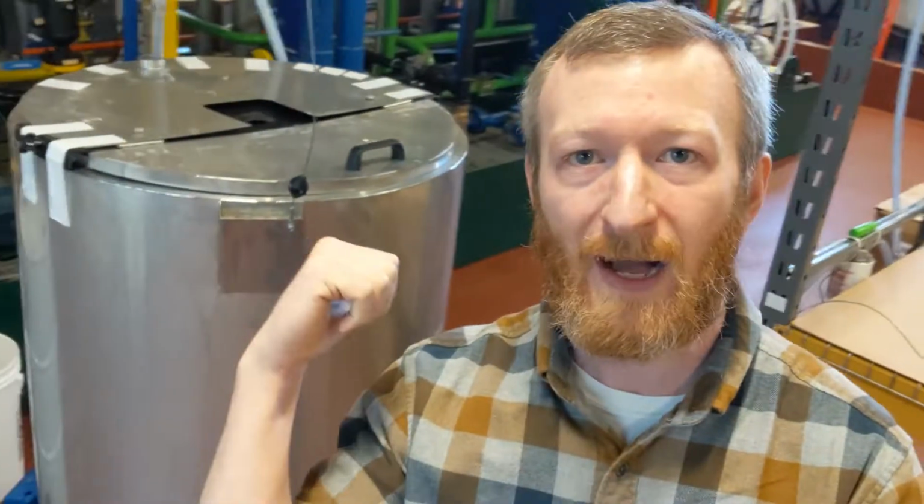The other cool stuff that we do here in the lab is focused on being the zero waste production facility. So we take that glycerin byproduct and we turn it into the soap that's used at the university. So this stainless steel vessel behind me is what we use to make soap. We take that glycerin byproduct, we remove any excess methanol that's left over in that glycerin, and then all of the other things that are making our glycerin fairly low quality compared to pure glycerin, they're actually really convenient contaminants. They're contaminants if you're looking at pure glycerin, but if you're looking at turning it into soap, they're actually all ingredients for making soap, which is great.